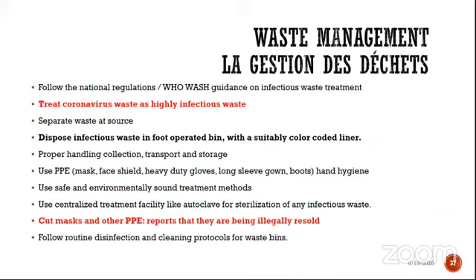Now the waste management. Follow the national guidelines and rules of WHO for infectious waste treatment. Treat coronavirus waste as highly infectious waste. First of all, separate all the waste sources, and dispose infectious waste into the bin that is suitably colored as the infectious waste bin.